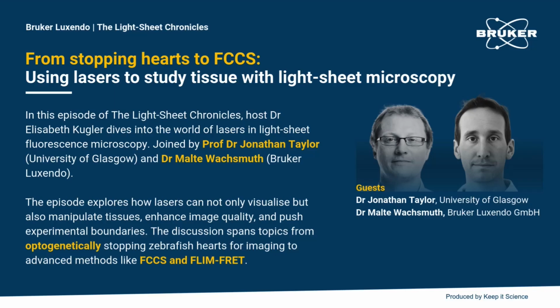Yeah, sure. A major difference of light sheet microscopy compared to more conventional epifluorescence or confocal microscopy is that you're actually illuminating your sample from the side and perpendicular to your viewing direction. That means everything that casts a shadow shows up quite clearly in the image immediately. So you have these very typical striping effects in light sheet images that everybody who has looked at light sheet data probably knows quite well.